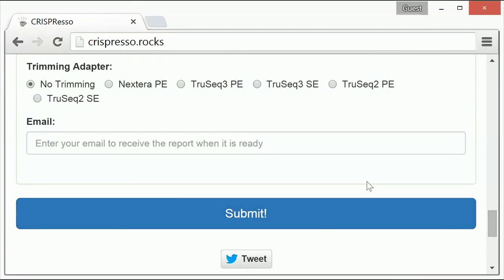Finally, you can click the submit button at the bottom of the screen. Clicking the submit button will allow CRISPResso analysis to begin.